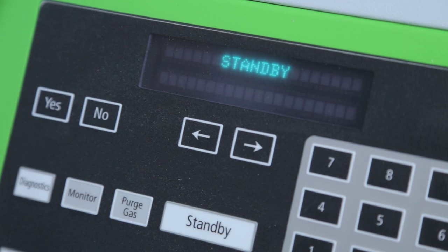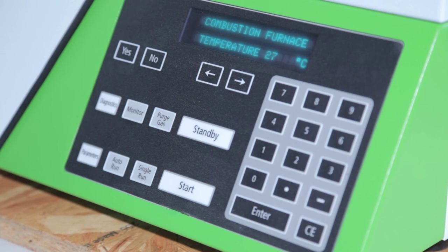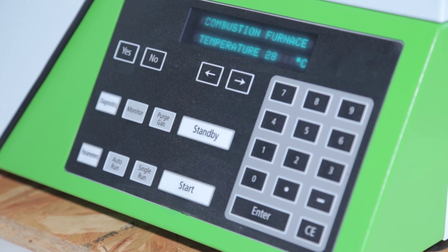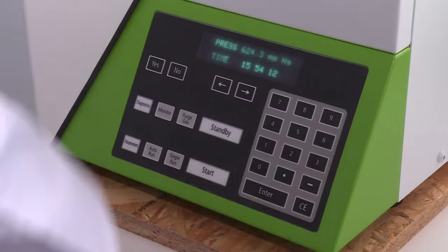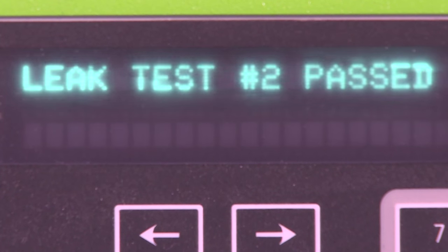Allow the analyzer to undergo a warm-up time of 2.5 hours. At the end of this period, turn on the furnaces. Once the furnaces have reached the program temperatures, check the combustion zone for leaks.